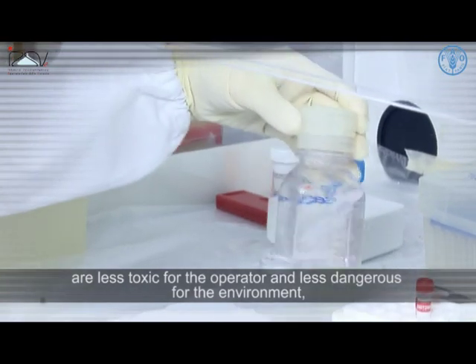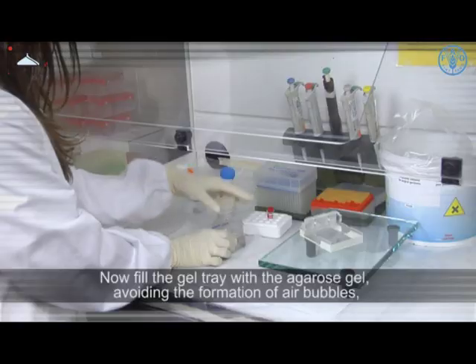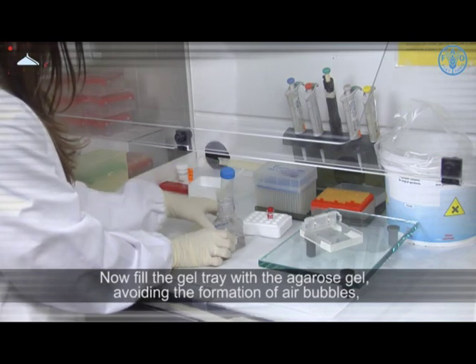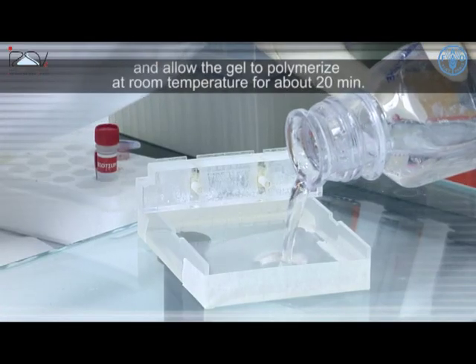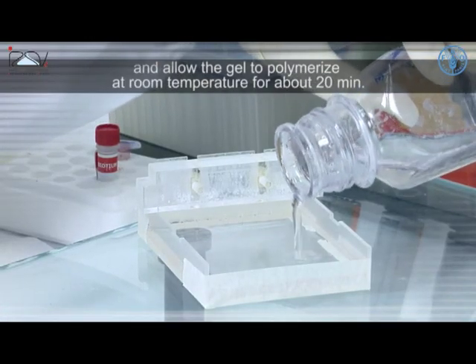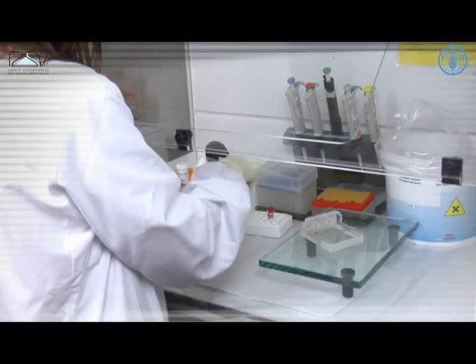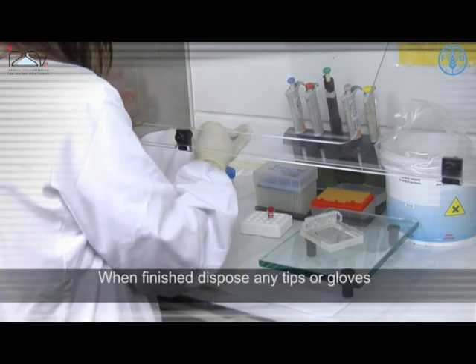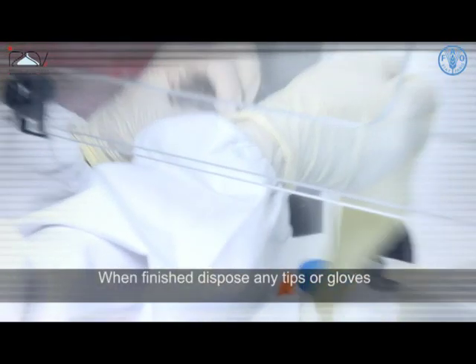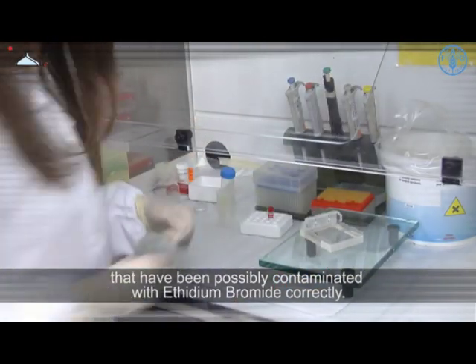Safer alternatives such as SYBR Green, CyberSafe, and GelRed are less toxic for the operator and less dangerous for the environment, but are significantly more expensive. Now fill the gel tray with the agarose gel, avoiding the formation of air bubbles, and allow the gel to polymerize at room temperature for about 20 minutes.